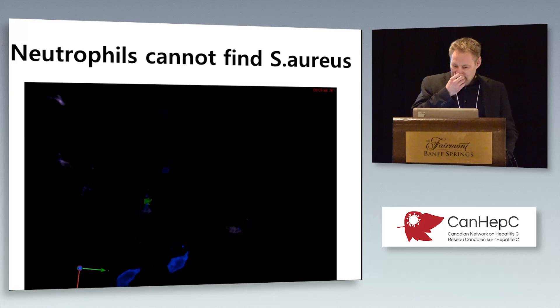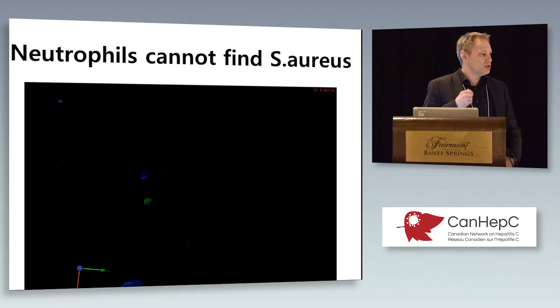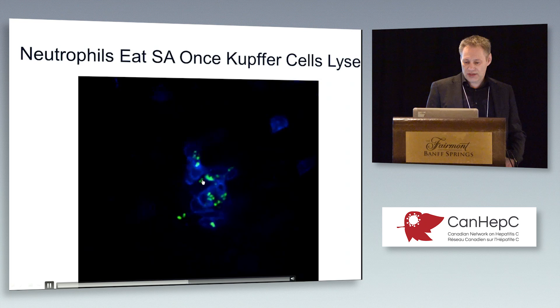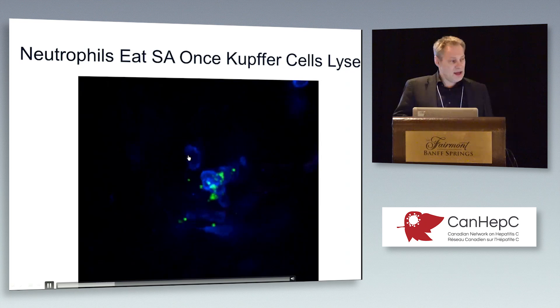The blue guys are neutrophils, the purple are Kupfer cells, the green is a bacterium. The neutrophils run right past these infected cells — they don't see them as long as the staph is hiding inside. Every so often we can actually watch one of these Kupfer cells lyse, and when they lyse, these blue neutrophils come charging in. You can see this one is really hungry — he takes up most of the food and runs off. I have someone in my family like that.